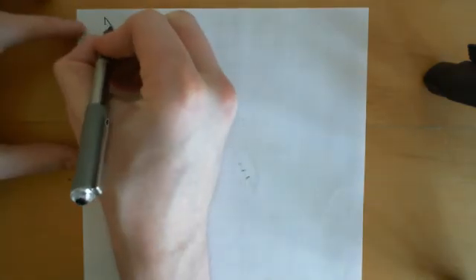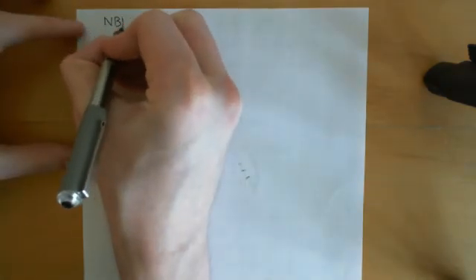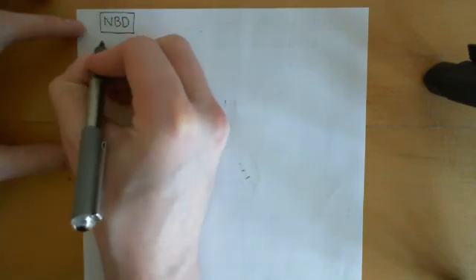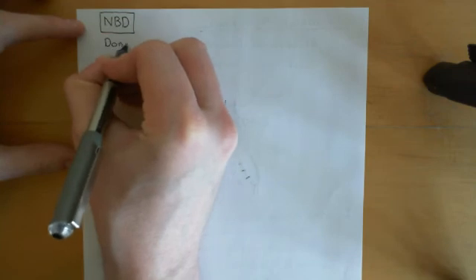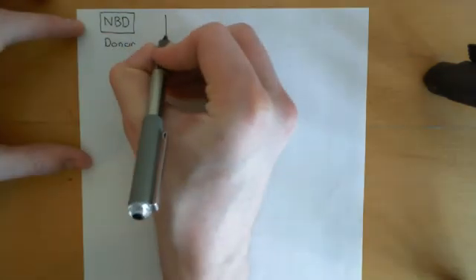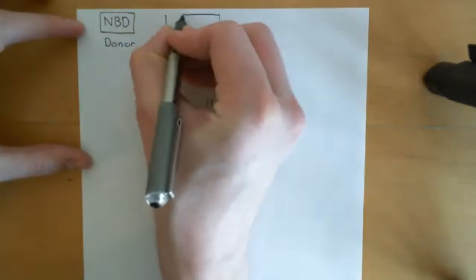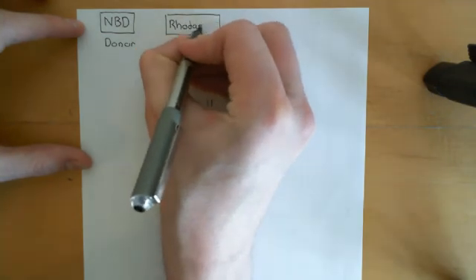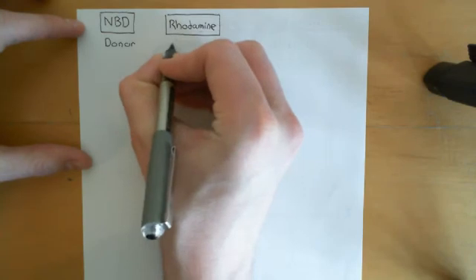Okay, so we are going to use two fluorophores. These two fluorophores are by the name of NBD. The NBD fluorophore is going to be our donor, so this is our first fluorophore. And then the second fluorophore that we're going to use is a fluorophore known as rhodamine, which is going to be our acceptor fluorophore. So this is our acceptor.